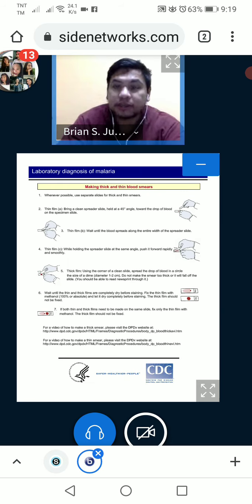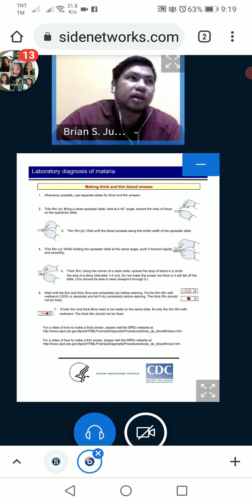Okay? And then you stain it. Usually, yung normal na staining na ginagamit for hematology, yun ang ginagamit for malaria. It's either Wright stain or the Giemsa stain. Okay? So, I will upload a video, no?